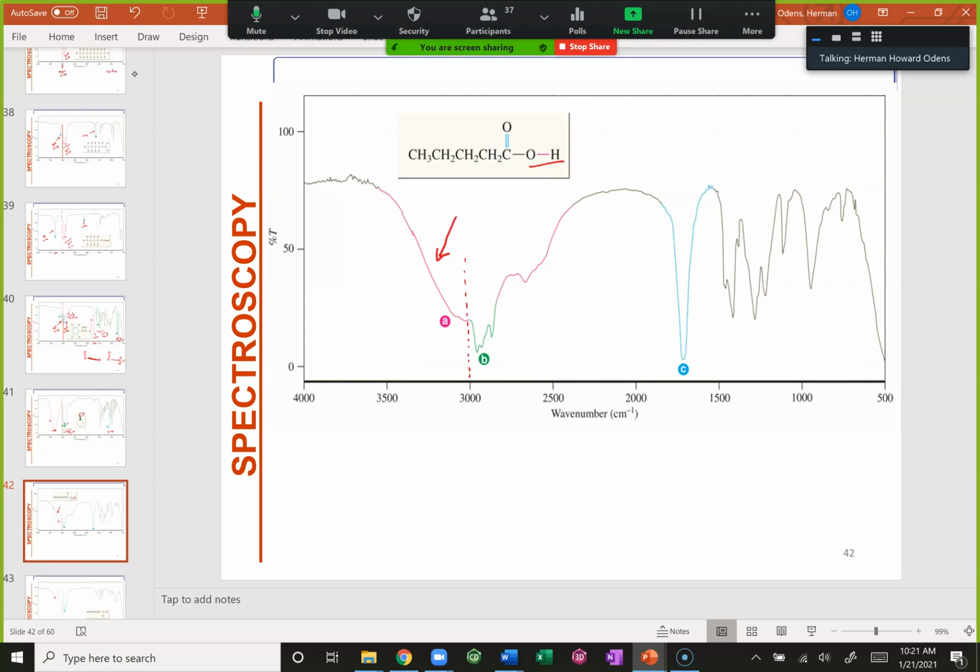Here, basically, you're gonna have to say this is your carboxylic acid functionality, because you're looking at this functional group here, but for a carboxylic acid, you also have to include the carbonyl. But this V shape here only corresponds to the hydrogen bonding happening with the OHs and the carbonyl of two molecules, like I showed you here.